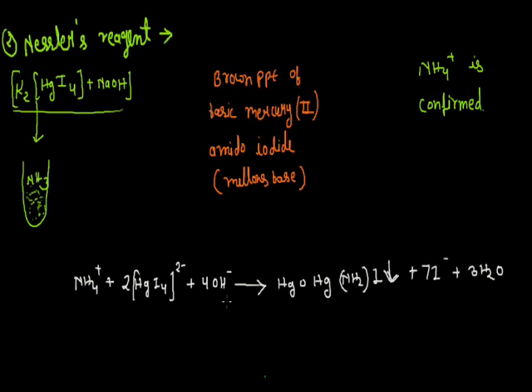Now these two confirmation tests confirm that our salt contains the cation ammonium.